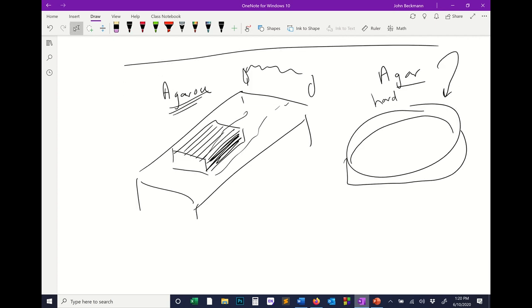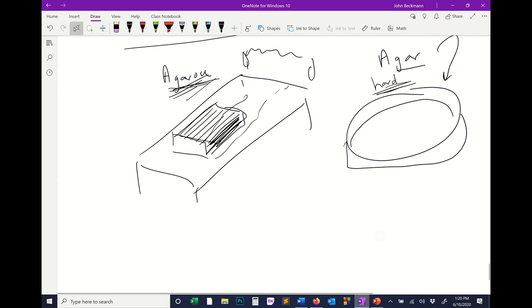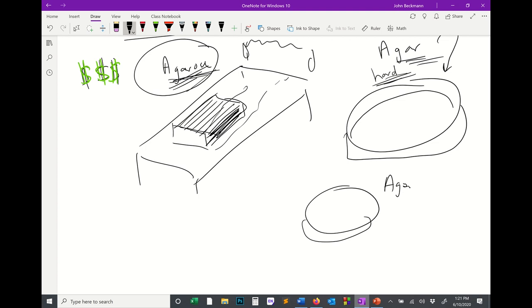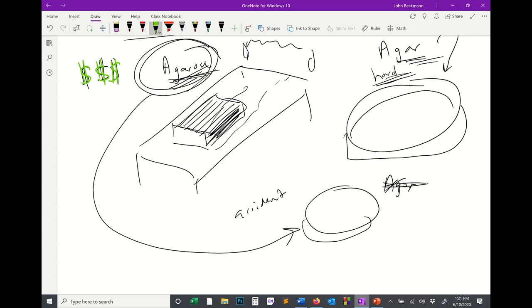The reason these things can be confused is because they sound the same, agarose and agar, and they actually have the same function. Agar is used to make media plates for microbiology. It's used to make hard media. And agarose is used to make hard gels that we run DNA through. They have similar functions, but the reason you don't want to confuse them is because agarose is very, very expensive. Agar is very, very cheap. So if you ever make agar plates, and instead of using agar, you use agarose on accident, you just lost a bunch of money. So do not make that mistake. Do not make agar plates with agarose.